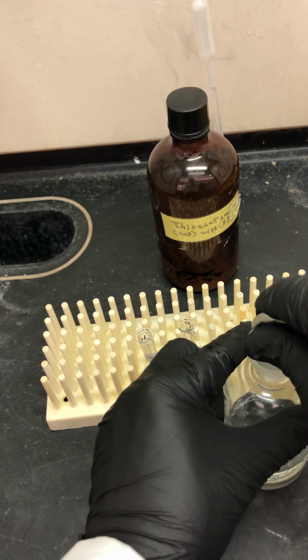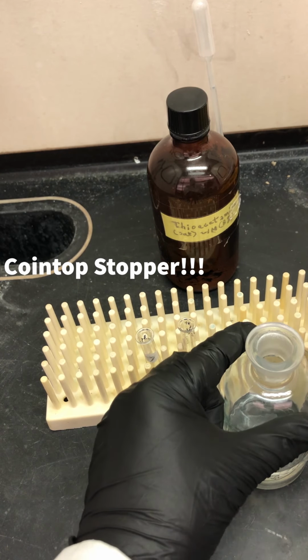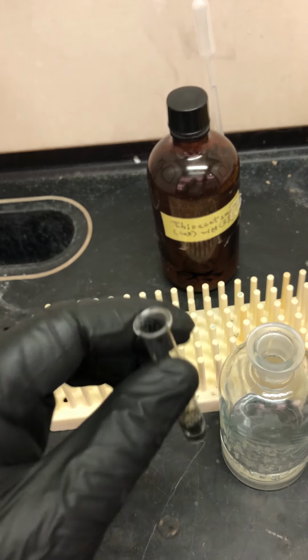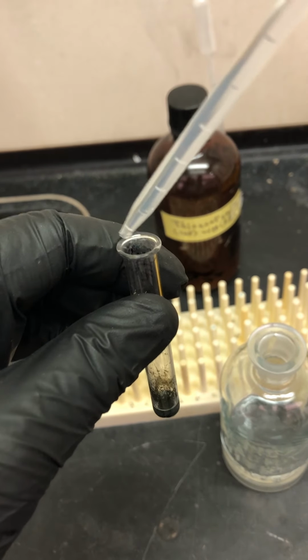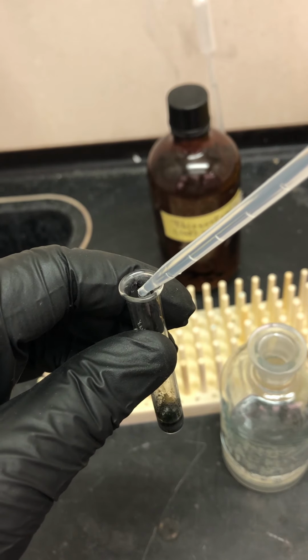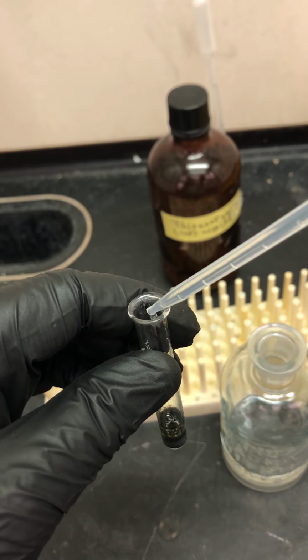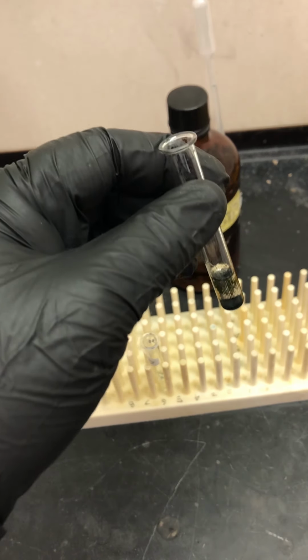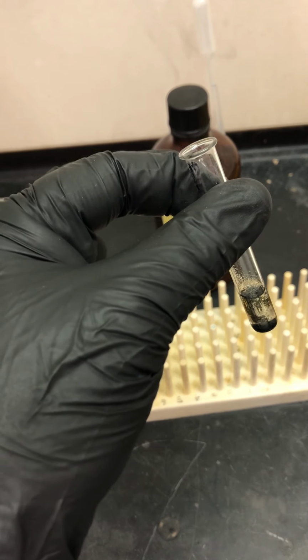Once more, dislodge the cork stopper cap, pull it out between your fingers and get some samples here. Let's put a few drops of this in here, 15 to 20 drops, into our pellet. And then let's put this back in there and get it out of the way. The nitric acid is going to help redissolve the pellet of copper 2 sulfide.